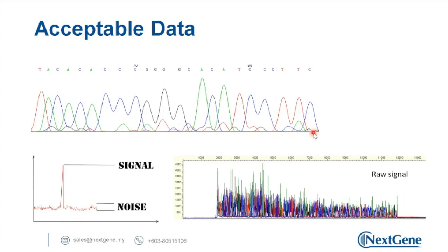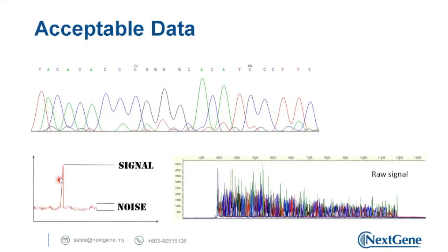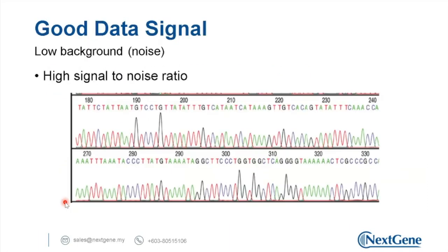One possibility is the signal to noise ratio that I mentioned in the earlier slide. Signal is actually the result of our new strand of DNA base.